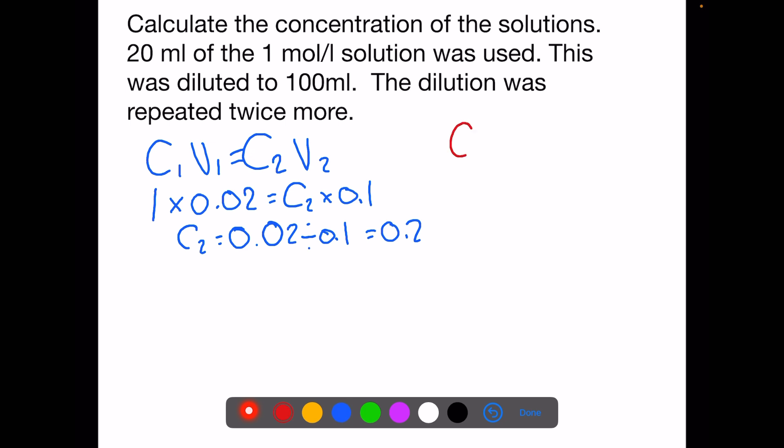We're going to repeat this twice more. C1 is now the new concentration and V1 is the amount that we're going to use to dilute. C2 is the concentration we're trying to find and V2 is the dilution volume.